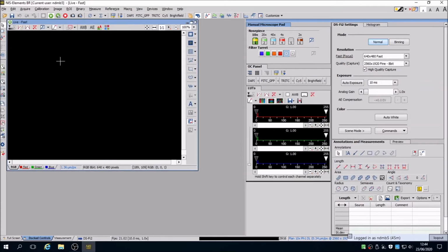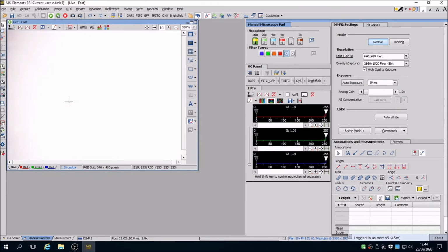You will notice in this case that there is no image visible. Firstly, turn on the bright field lamp and rotate the port position knob from eyepieces on position 1 to position 4 to direct the light to the color camera on the front port. You should now see light in the Live View window.